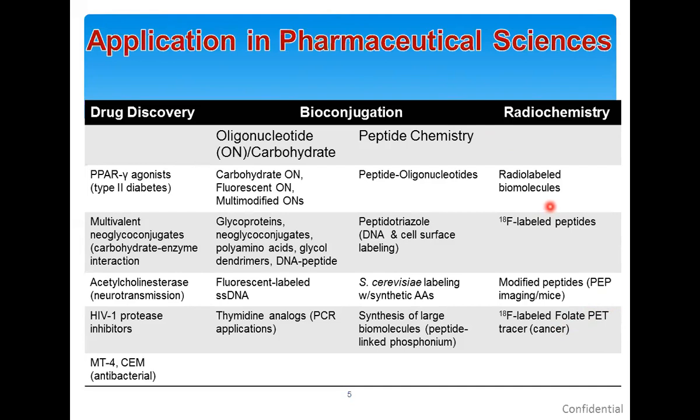It is an important tool to assess novel drug candidates. That's what they study in radiochemistry. So you can see the application of this click reaction in pharmaceutical sciences.